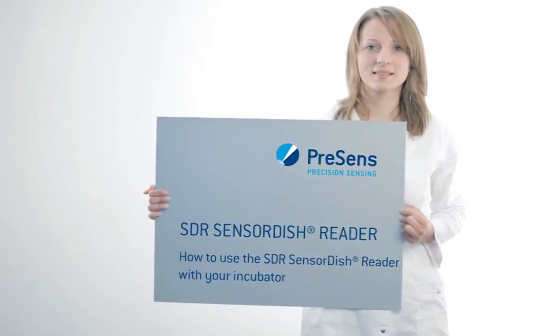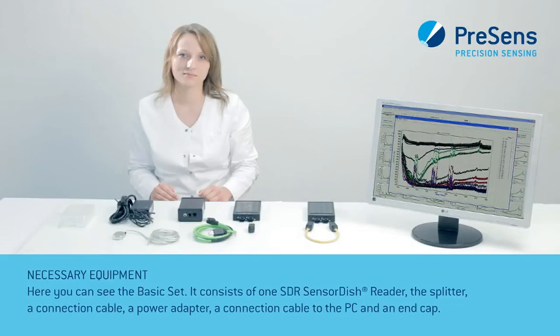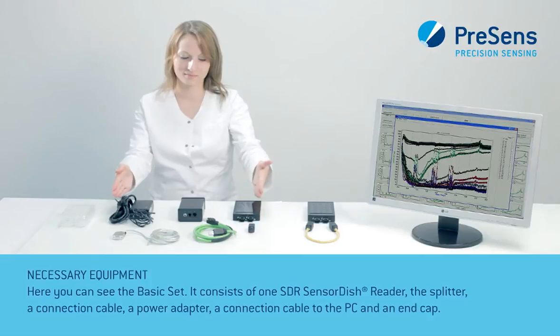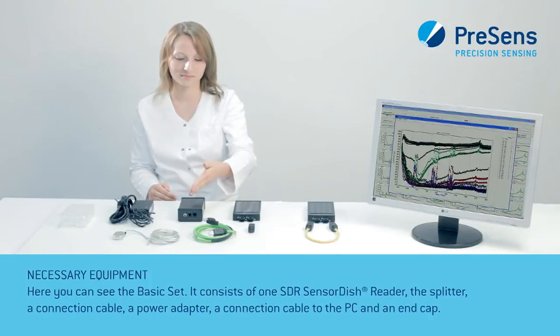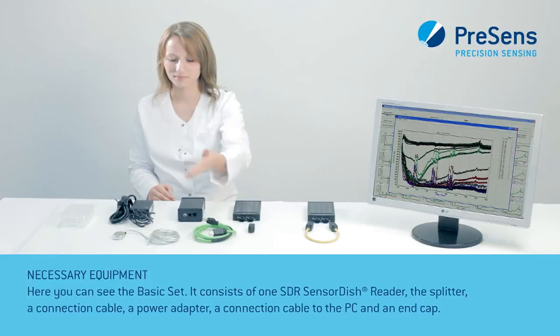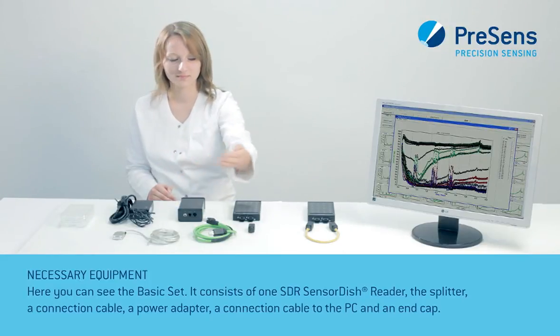Now we will show you how to use a sensor dish reader with your incubator. Here you can see the basic set. It consists of one sensor dish reader, a splitter, a connection cable, a power adapter, a connection cable to the PC, and an end cap.